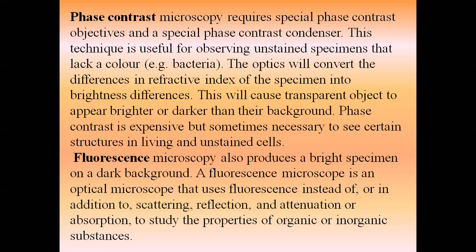Okay, so in that case, we can use this type of microscope, that is phase contrast microscopy. In this, the optics will convert the difference in refractive index of the specimen into a brightness difference. So this is the idea of phase contrast. So what does phase contrast do?